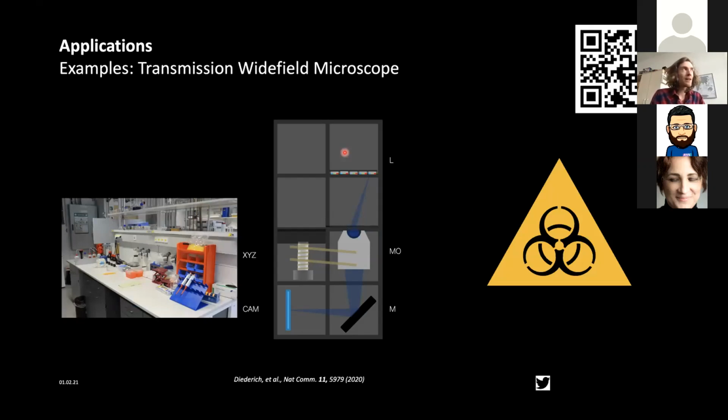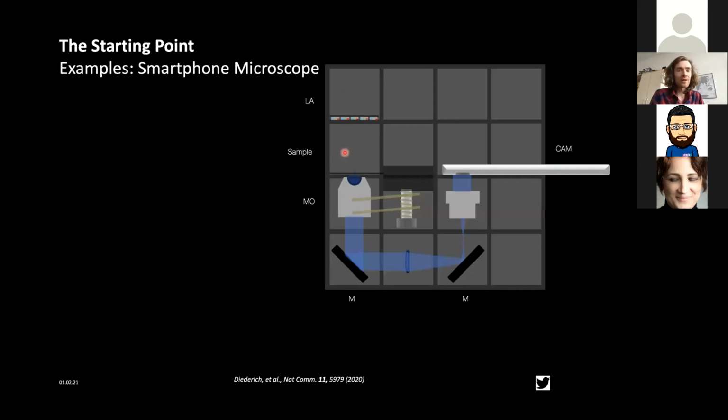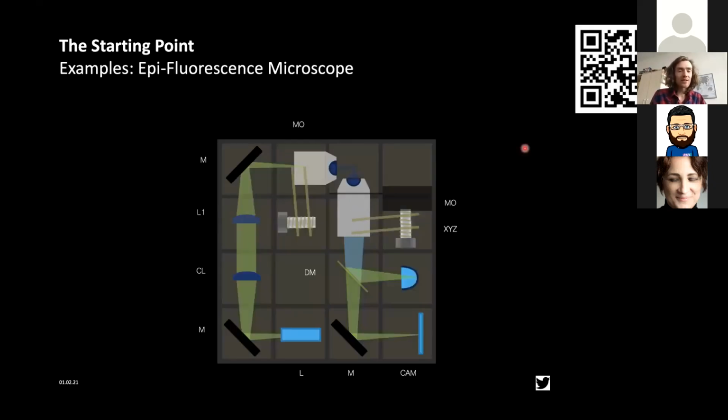Well, but if you want to have something a little bit more advanced, for example, like taking videos or having an infinity microscope instead, of course, you can also do that. You can also swap the camera, for example, from a Raspberry Pi and exchange it with your camera from a cell phone. Or even more advanced, you can create a light sheet microscope where you illuminate your sample, as you may know, with a light sheet, like a paper thin sheet from the side, and you detect the fluorescence signal perpendicular to that and create, for example, 3D stacks from your image and make very nice 3D volume images.